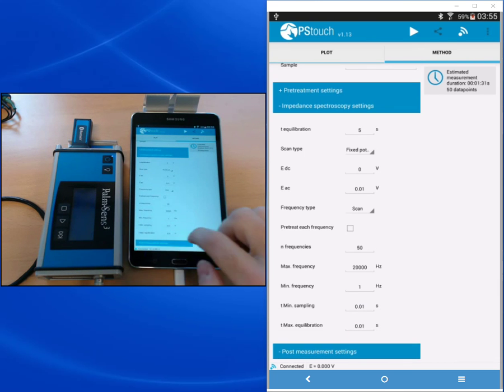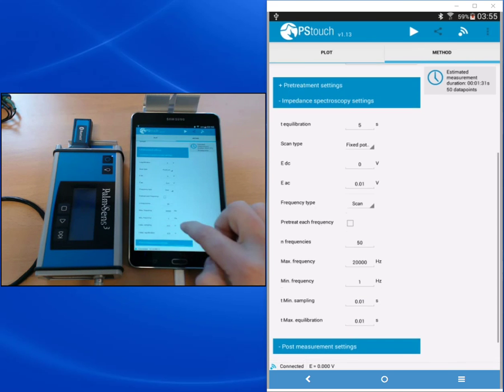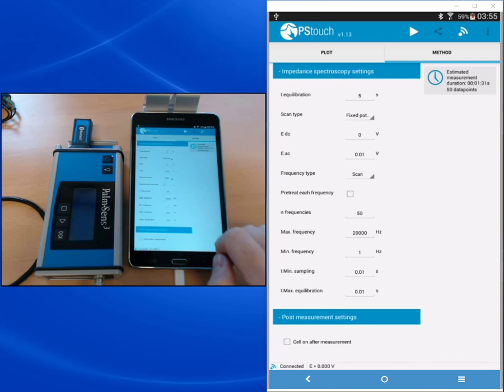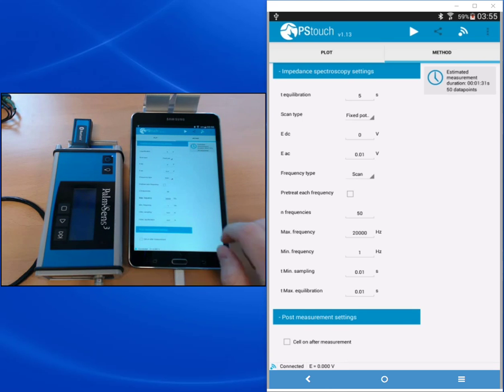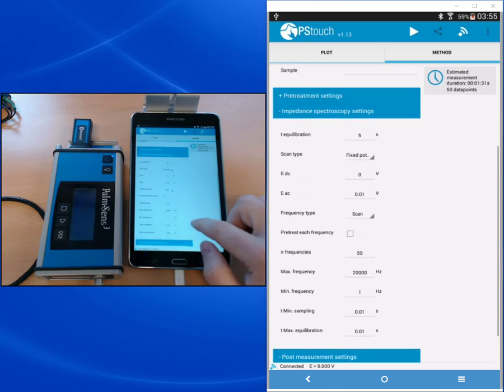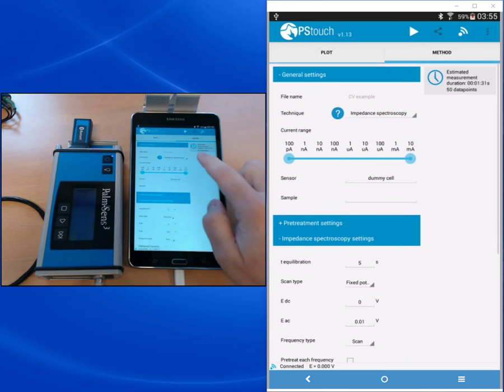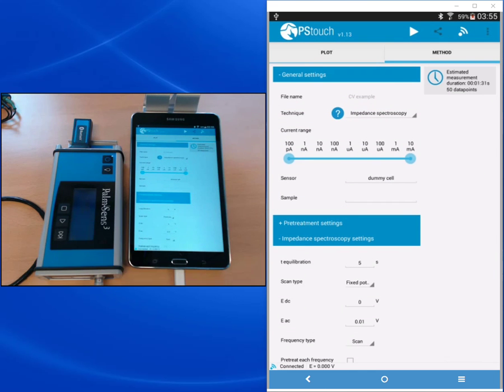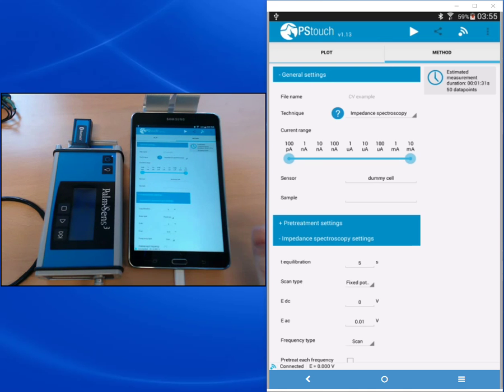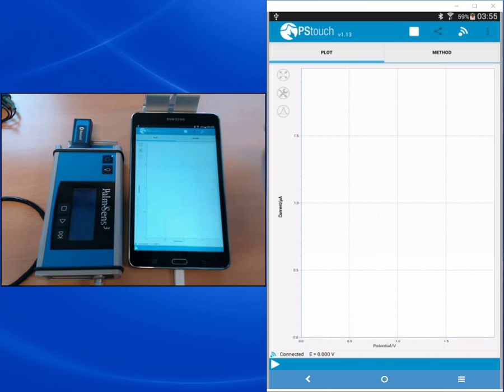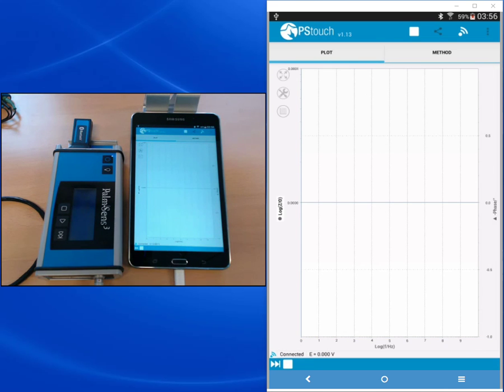The last point is again the post measurement settings where you can set the cell on after the measurement. We don't need this so we leave this unchecked. On the top right of the method editor you see the estimated measurement duration and how many data points we will measure. This time is now 1 minute 30 seconds, and we're pressing the run button to start.